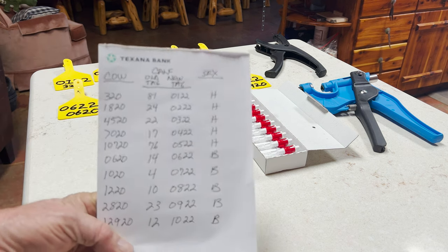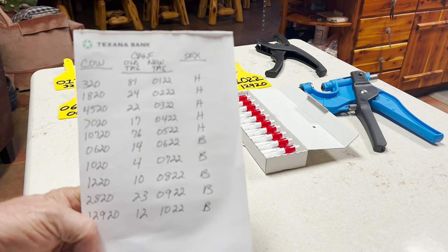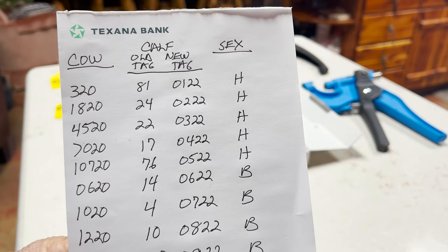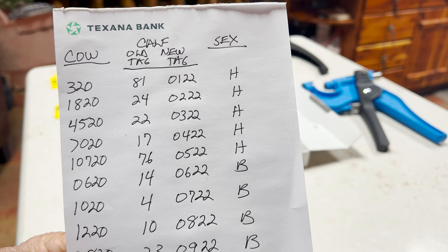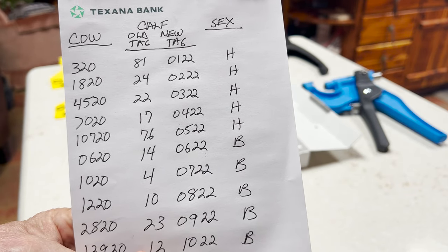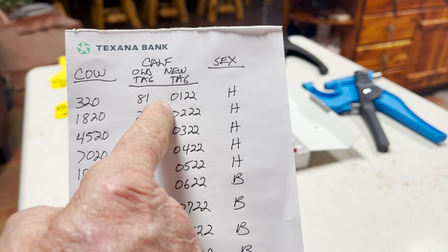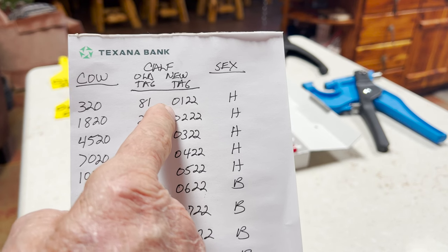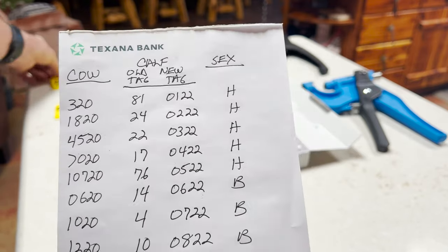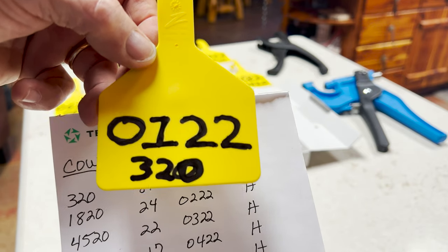Prior to getting ready, I've made a list. I've got the cow numbers, the calf numbers with their old tags. I've got the cow number on the left, the calf and the tags they currently have. We will catch them in the chute, cut the old tag out, and put in the new tag with the appropriate number we've already made. So we know that calf number one's mama is 320, and I've got all that ready so all we have to do is cut out the tag, put the new one in, and collect the DNA sample.